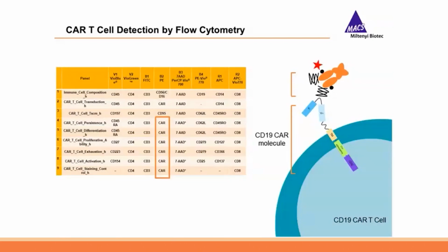It's because the CAR-expressing T cells represent the therapeutic cell fraction, and that's why it becomes even more critical that the quantification and the level of expression of the CAR molecule is done in a highly reliable manner.